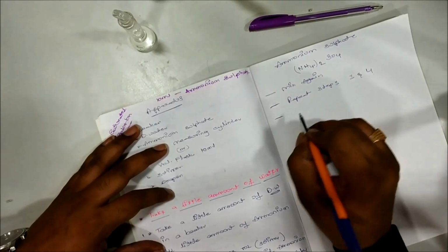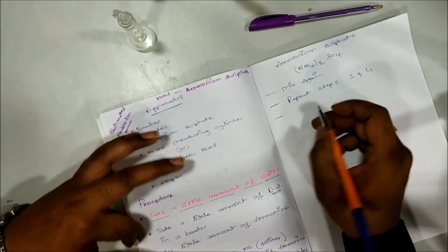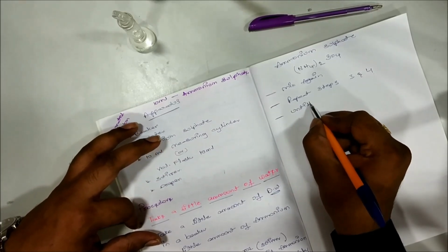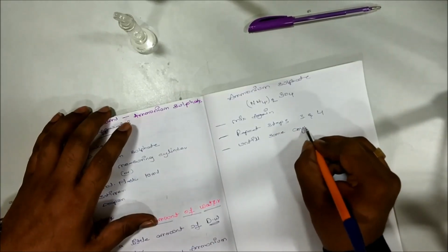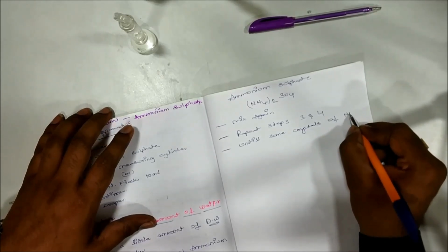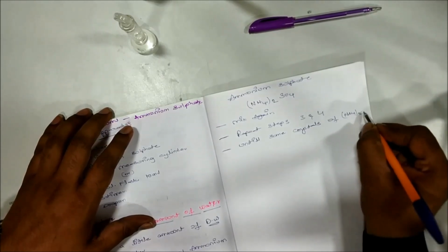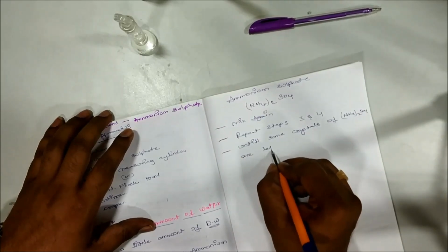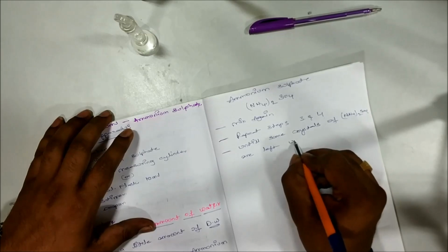And up to what time you have to repeat this step? Until some crystals of ammonium sulfate are left undissolved.